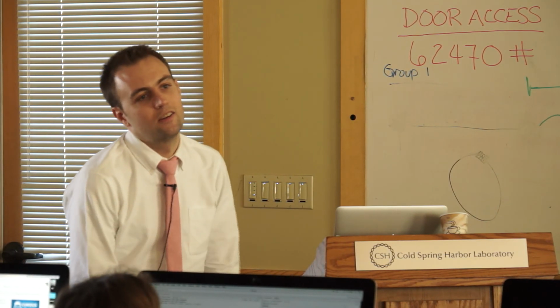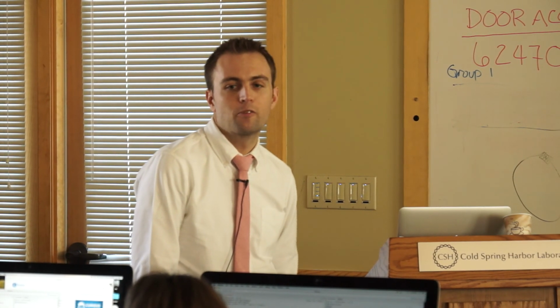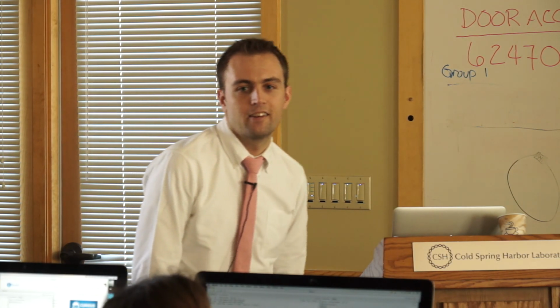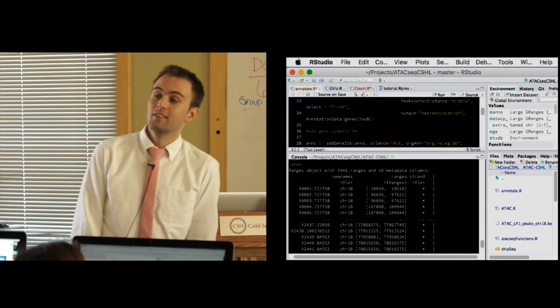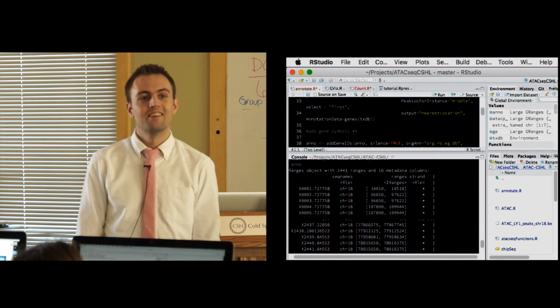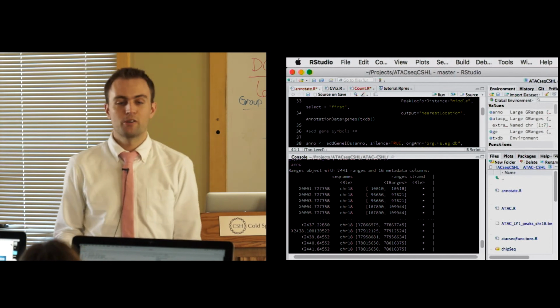So you have a region, a promoter, and you want to take a stab at what transcription factors might be binding there. How might we get a sense of that, or ask that question? Yeah, that's a great approach.